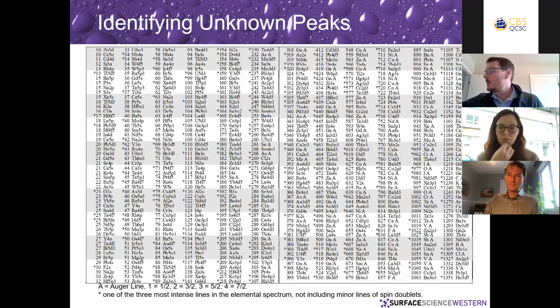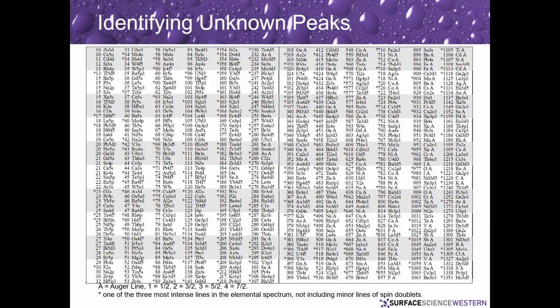It's nice to have something like this book that has reference spectra, because one of the big things that gets confusing is, we have all these peaks listed, but if I have only a small amount of, say, iron, what's the strongest peak? What peak should I be looking for? You can look in a book like this, find iron, look at the spectrum, and see that the 2p peaks are the strongest ones. So if I think I have iron, those peaks should be there. Then, to confirm it, maybe some of the smaller peaks, like the 3p or 3s peak, might be there if it's a really strong signal. Some of this can get complicated, because you need to understand what peaks should be there. If your strongest peaks aren't there for your element, and you're seeing a peak that might be for that element, it shouldn't be that element unless the strongest peaks are there.